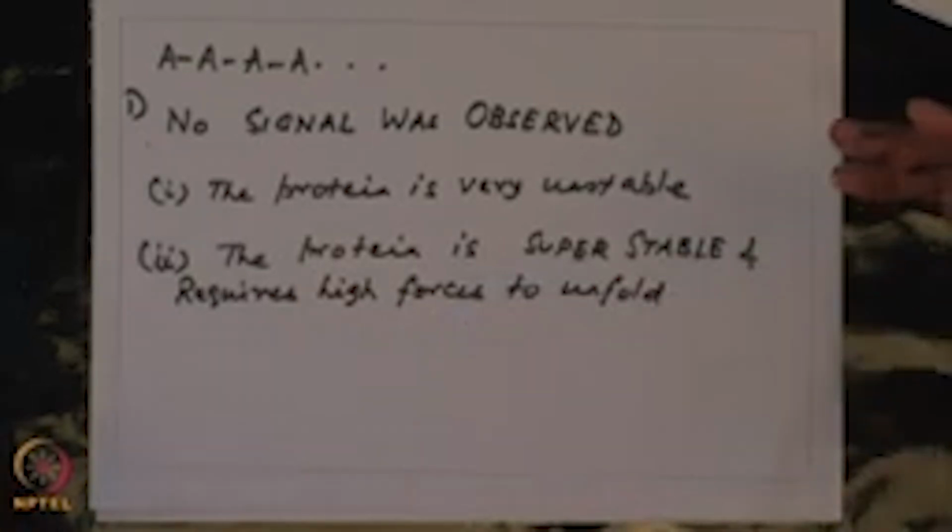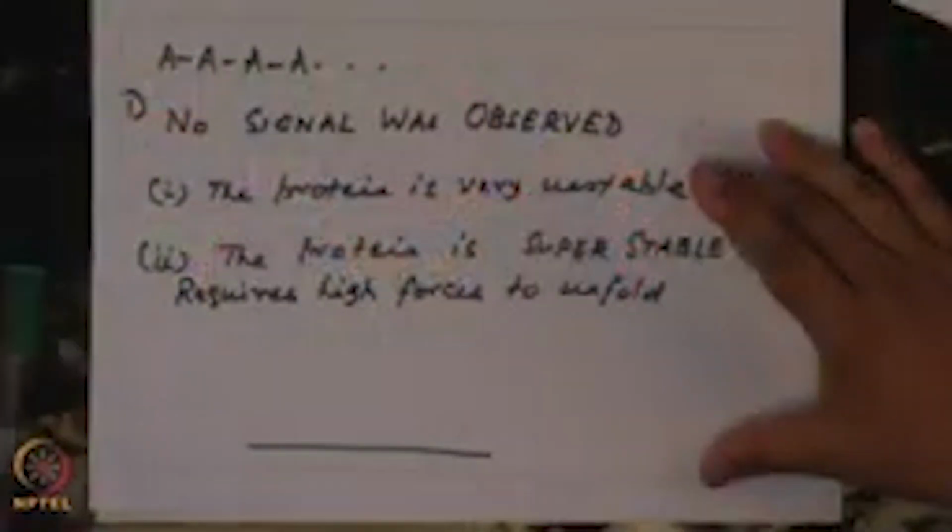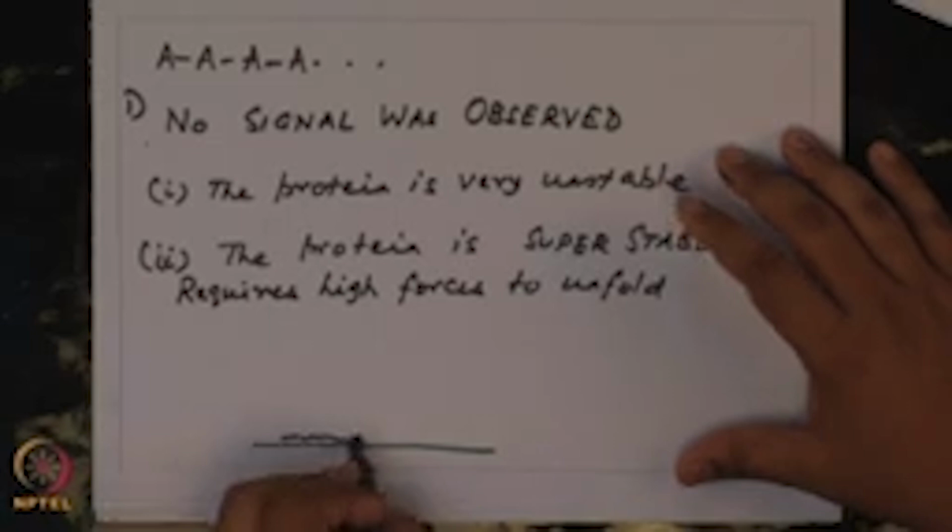This is somewhat counterintuitive. Why am I saying this? If we know that the protein is stable, why are we not able to detect it? The reason is as follows. So, you have your substrate and your protein is anchored.